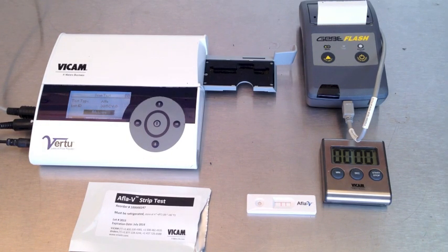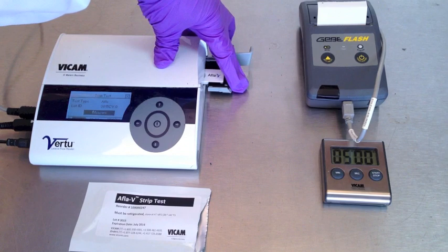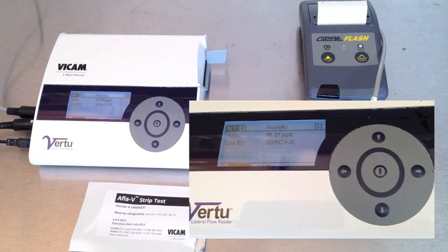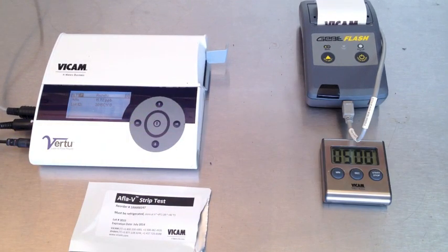Allow the strip test to develop for five minutes on a flat surface, such as a countertop. After five minutes, insert the AFLA-V strip test into the VR2 reader — the circular edge should go into the left-hand side of the reader and be loaded in first. Press the center button to start measurement. In a few seconds, your results are shown on the screen. Use the right arrow button to move the cursor to P and press the center button to print the results if desired.